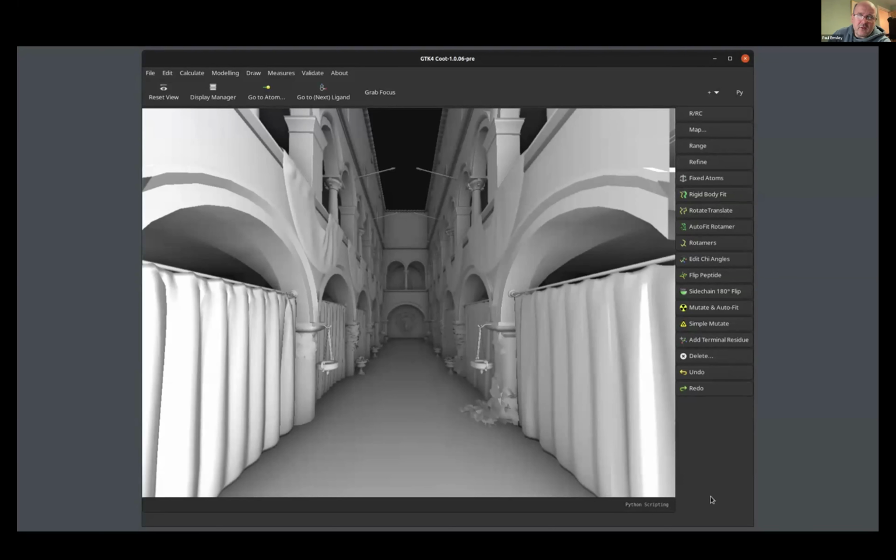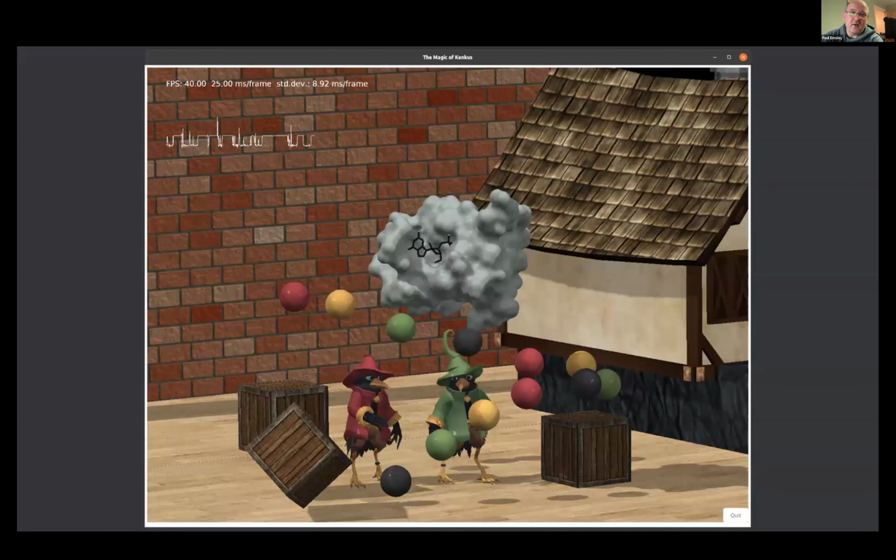So what we're looking at here is a thing called ambient occlusion, and it's a big thing in games because it makes the representation of geometry more realistic. The only thing that we're looking at here, we're not looking at shadows or colors or texture mapping or anything like that, only the ambient occlusion. And I put it to you, ladies and gentlemen, that you get a good representation of where things are in space using the ambient occlusion engine that's now in Coot.